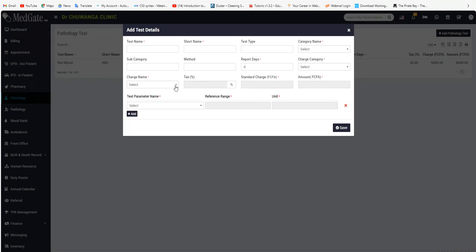So if you do serology at 20,000 francs, for example, and there are 7 tests under serology at a cost of 20,000 francs, then you need to split that up, 20,000 divided by the 7 different tests, and create a different charge for each of the tests and put it in the system. When you do that, you can now add the tests one by one.